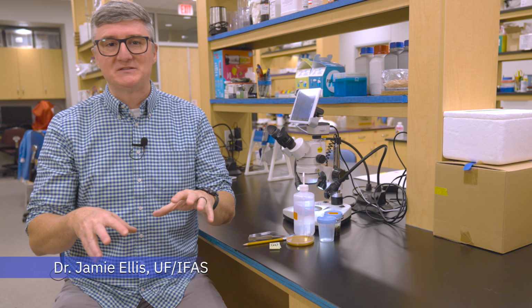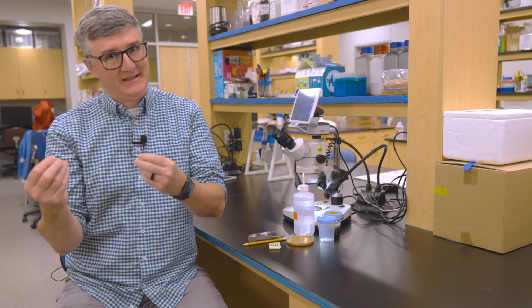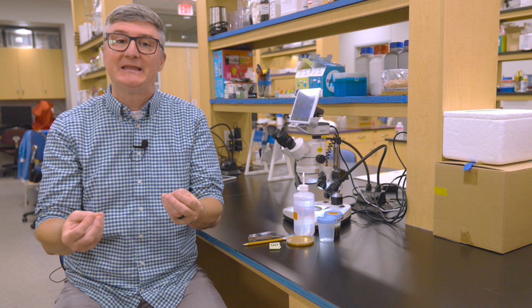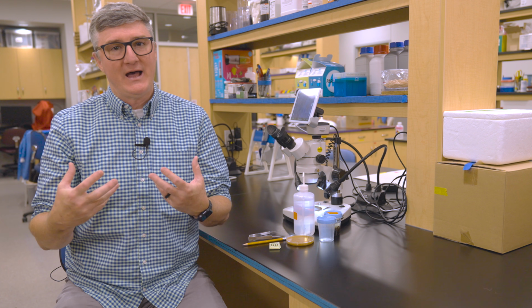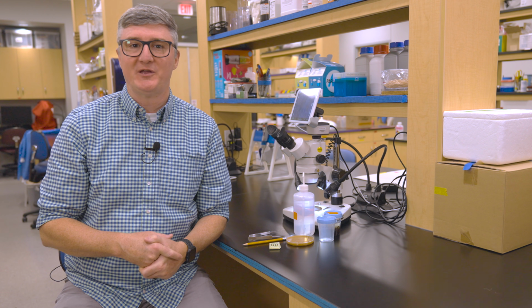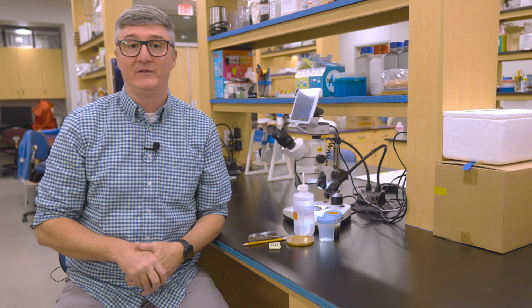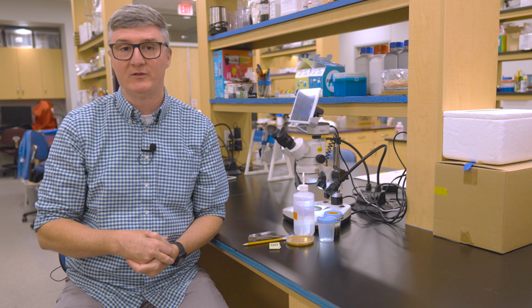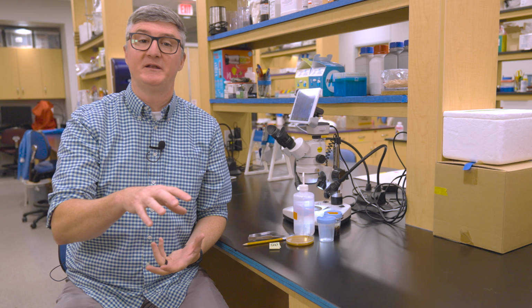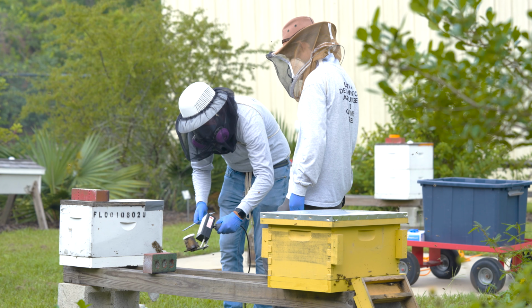I want to talk to you in this video all about tracheal mite dissection. Tracheal mites, like the name implies, are mites that get into the tracheal system of the honeybee. While they're not as much a problem as people once thought they were, you hear pockets of tracheal mites popping up all around the U.S., and we know they have a distribution in many countries around the world. So I want to talk to you a little bit more definitively about how you would identify tracheal mite infestations in the field.